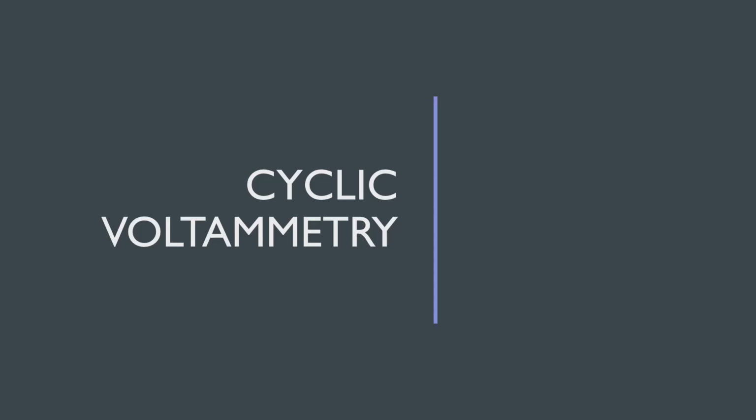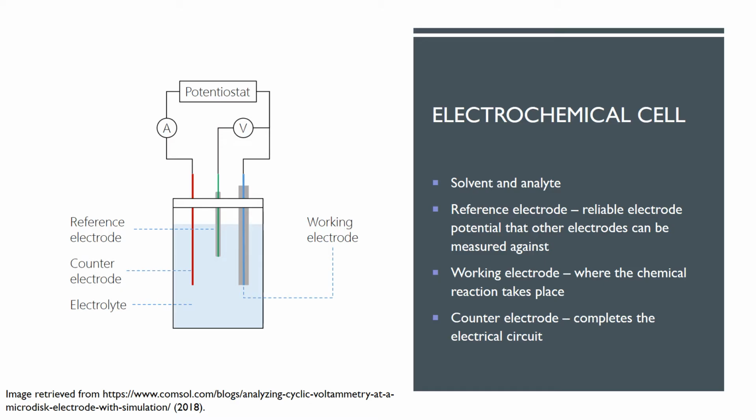So next we're going to talk about some background of cyclic voltammetry. To collect the data and conduct the experiments, an electrochemical cell is used. Within the cell, there's a mixture of solvent and supporting electrolyte, and the solvent is used to dissolve the analyte, or the chemical species that's being investigated. The electrolyte solution assists in balancing charge and increasing solution conductivity.